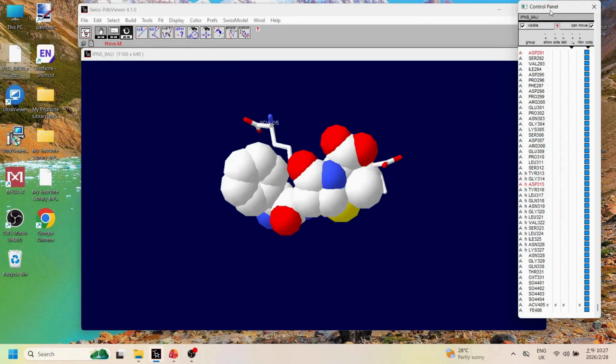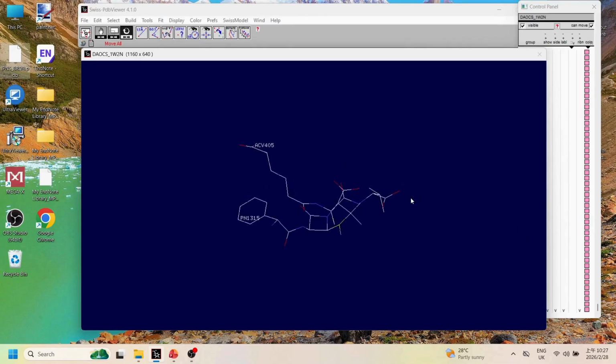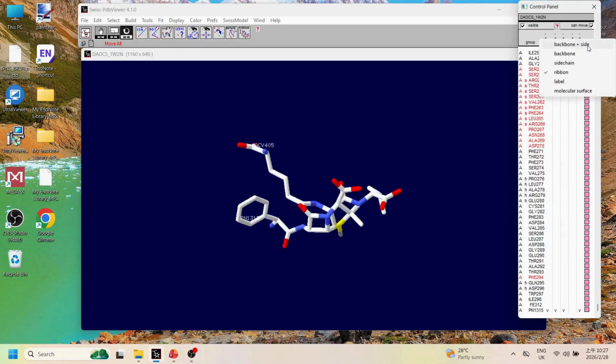You can use the techniques that you have learned in the earlier tutorial videos to create an image or diagram that clearly explains your rationale and highlights the structural similarities and key functional sites. This is a great way to communicate your analysis effectively.